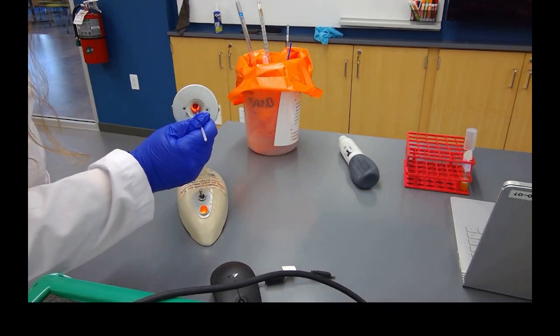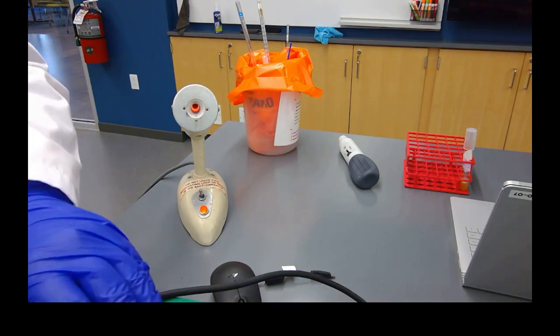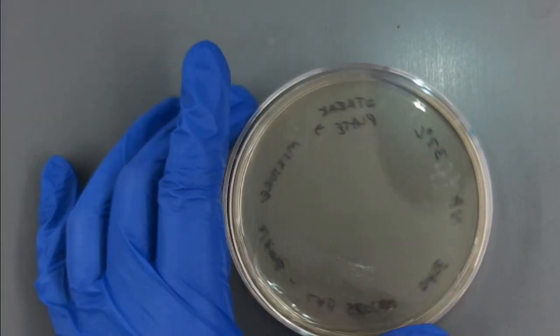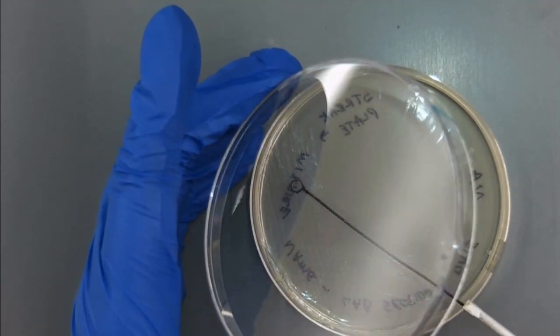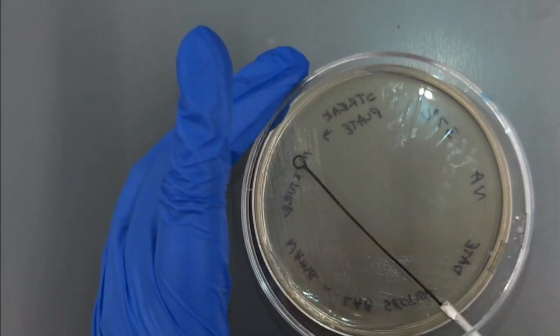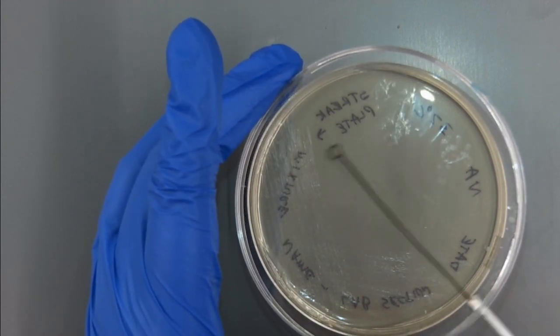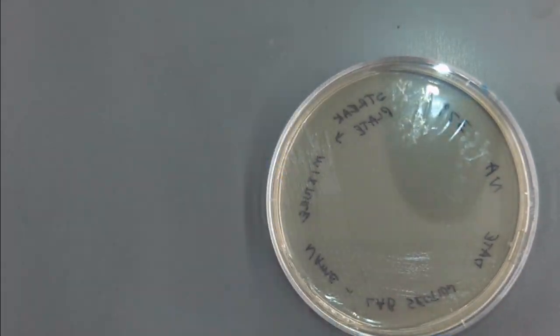Again, I'll take my loop and flame it. I'll place it in the back of the incinerator until it becomes red hot. Withdraw it and let it cool. Now I'll return to the plate. Remember that I'm not putting any more bacteria on the plate. I'm just using what's already on there. I will rotate the plate, take my loop, spread the bacteria into a new section of the plate. I want to be careful not to scrape the agar, not to dig into it, and not to touch my original set of streaks.